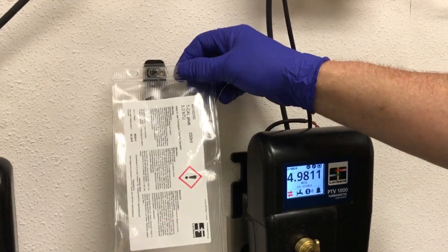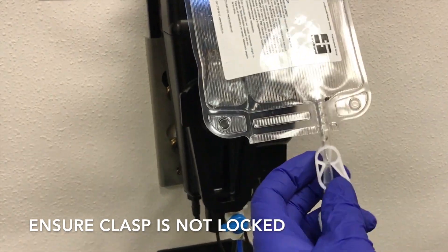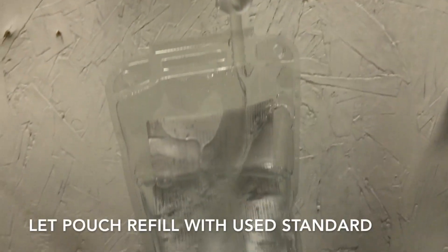With the calibration complete, the standard can be removed. Unhook the used TCAL Plus while making sure the clasp is not locked. Allow the used TCAL Plus to hang freely below the PTV. The used standard will cleanly refill the TCAL Plus pouch.